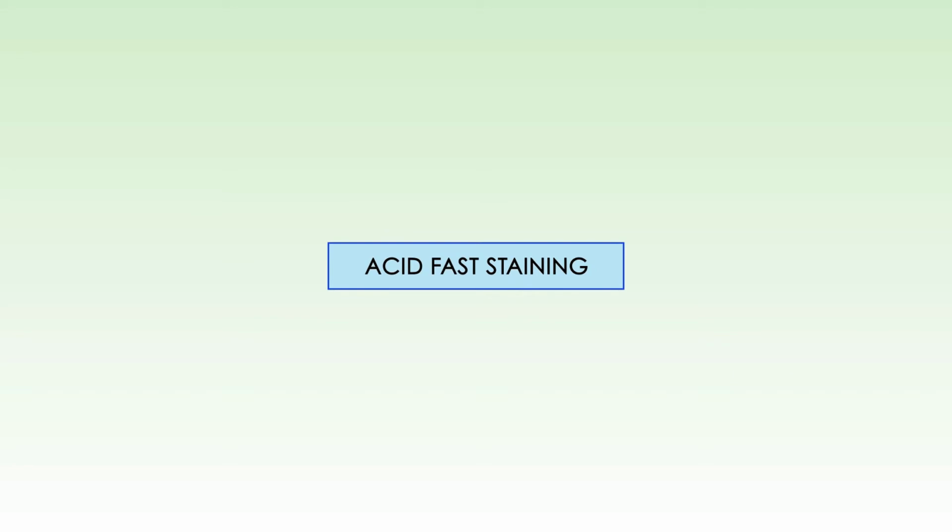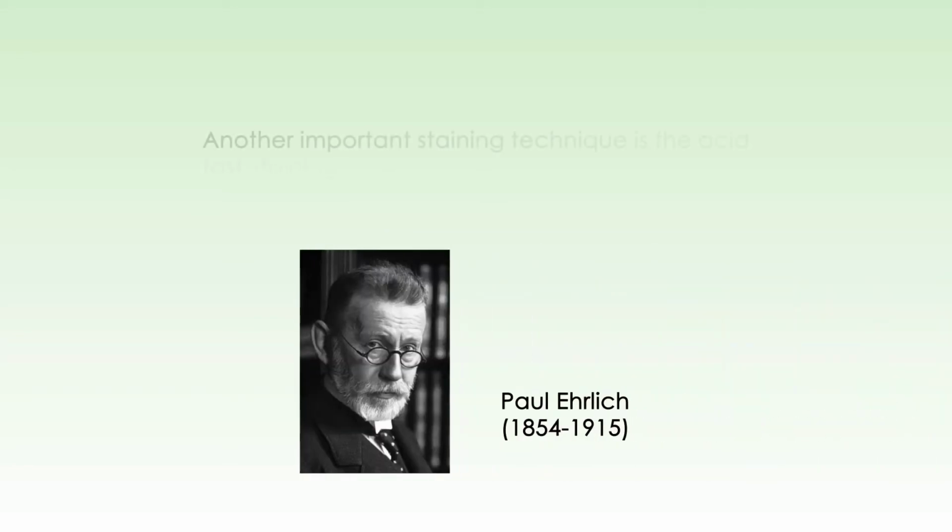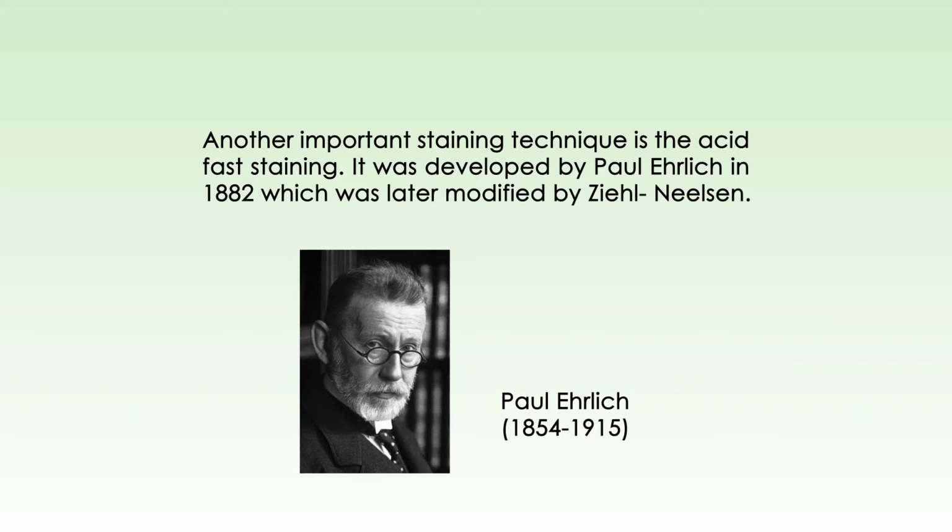So next is acid-fast staining. Another important staining technique is the acid-fast staining. It was developed by Paul Ehrlich in the year 1882, which was later modified by Ziehl and Neelsen.